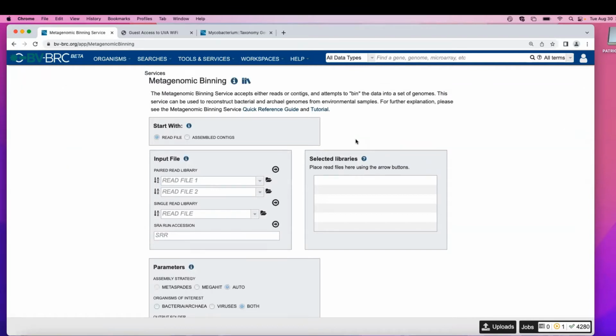Metagenome-assembled genome? Yeah, and that's what the service is giving you, right? It's just called something different. So you'll see MAGs all over the place nowadays. Well, binning is the act of generating MAGs. People will recover genomes from metagenomic samples and publish that spectrum of organisms and the assembled genomes from wherever, from the swamp or whatever. And there are many, many of them in BV-BRC now because they're in GenBank and we pull GenBank. This service actually predates even the term MAG.